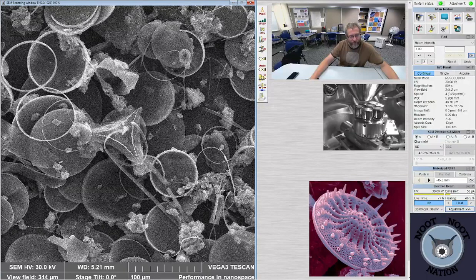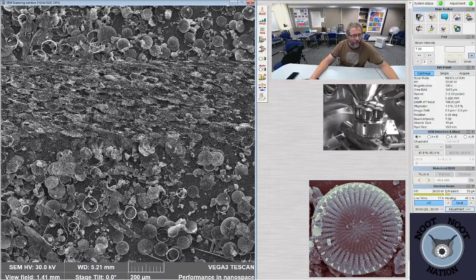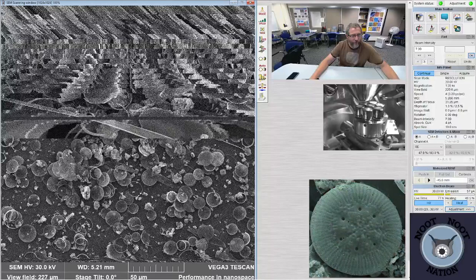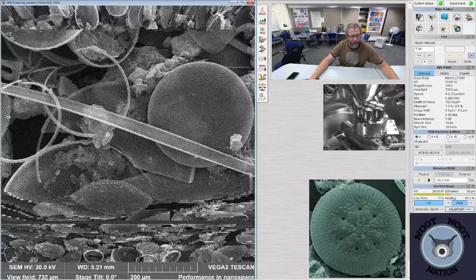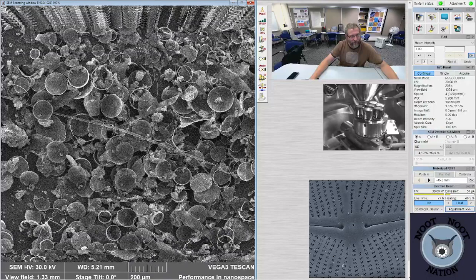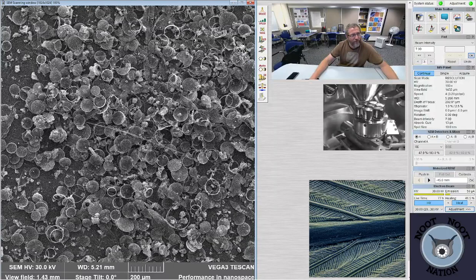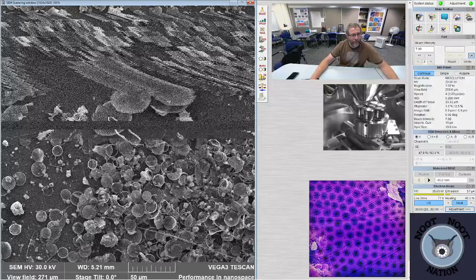And this is another piece of plankton in here. Not so much Skeletonema or anything. Oh, there's one of these really long. This is Thalassiothrix. This guy right here. That's all one diatom. It's like 300 microns. See, it starts here. It's still going over there. That's 800 microns. I think we found one that was like 3 millimeters once. Just went on forever. That's about a millimeter and a half, that one. It's a big diatom. You could see it and pick it up with tweezers, probably. Okay, let's, oh, that's a cool pattern.